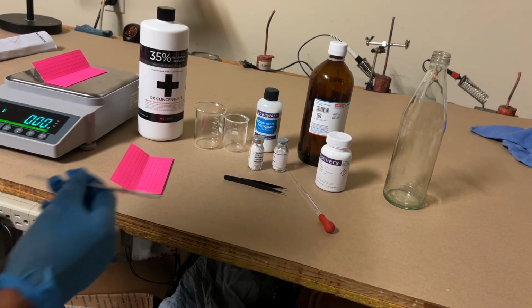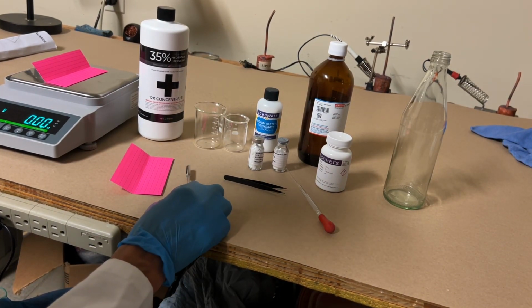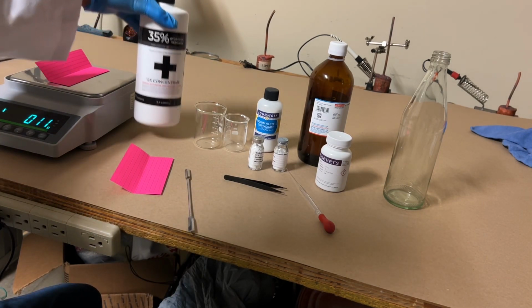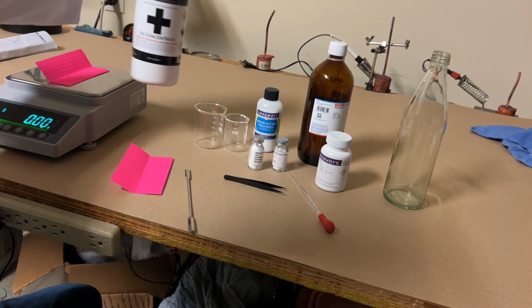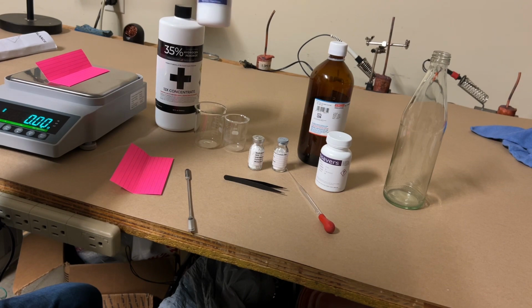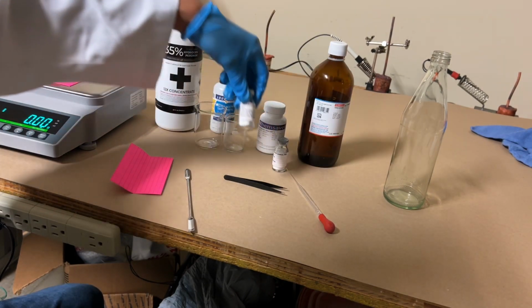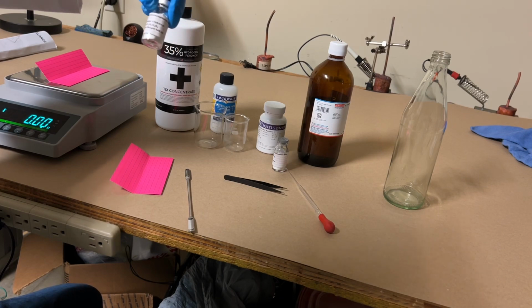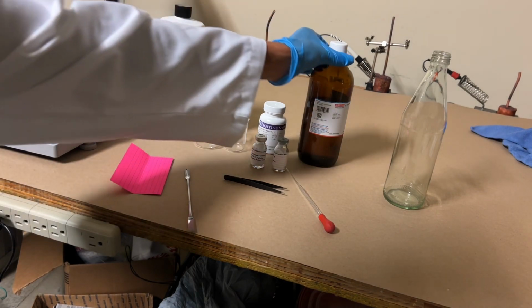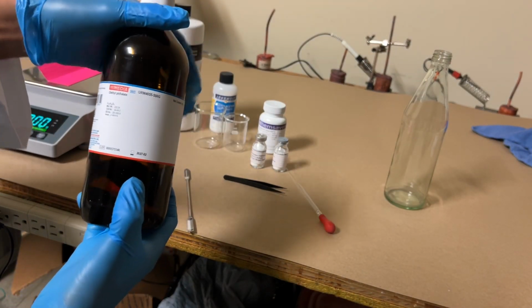Welcome back. In today's experiment, I'm going to demonstrate chemoluminescence, or light produced by a chemical reaction. To do this experiment, we're going to need several chemicals, including hydrogen peroxide, a buffer or weak base, sodium acetate, a dye, and then a trichlorophenyl oxalate ester. When these chemicals are mixed together in certain organic solvents, in this case I'm going to use diethyl phthalate.